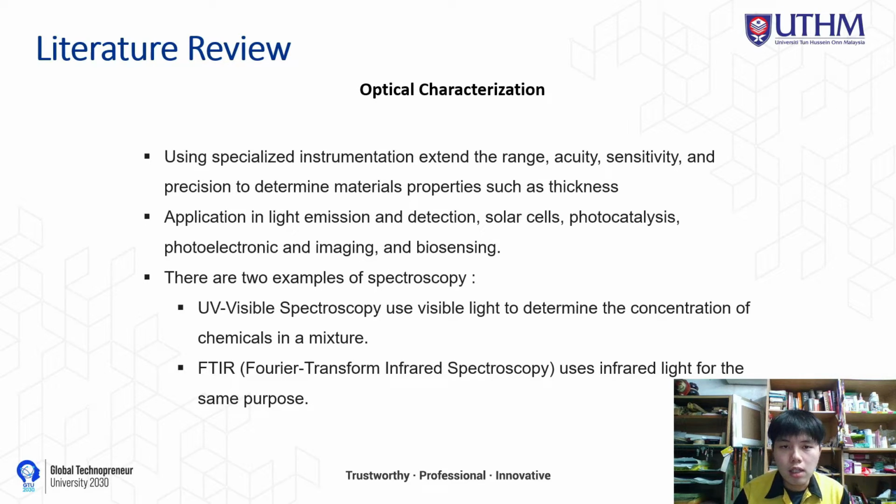I will introduce the optical characterization, using specialty instrumentation to extend the range, accuracy, sensitivity, and precision to determine material properties such as thickness. Optical characterization is mostly applied in light emission and detection, solar cells, photocatalysis, photoelectronics and imaging, and biosensors.